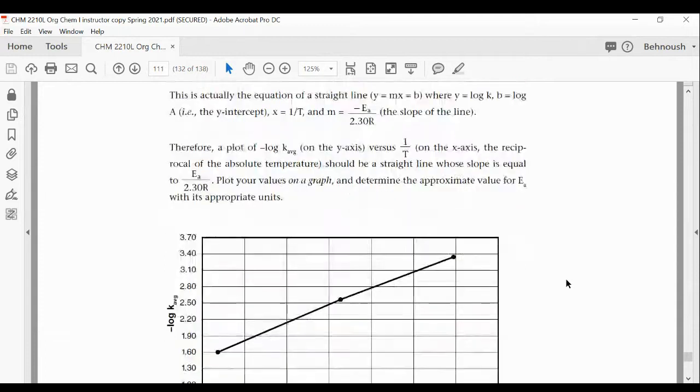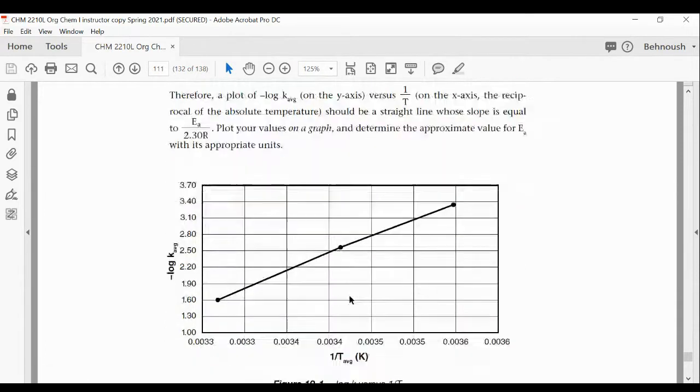So as part of the report, there is a graph, and this is the last part of the report actually. At 3 different temperatures, when you are studying the temperature effect, you are going to find the value for K. Basically, you find the T, and then you will say K equals 0.104 divided by that T. When you plot this against 1 over temperature, that's in Kelvin, then you can calculate the slope.